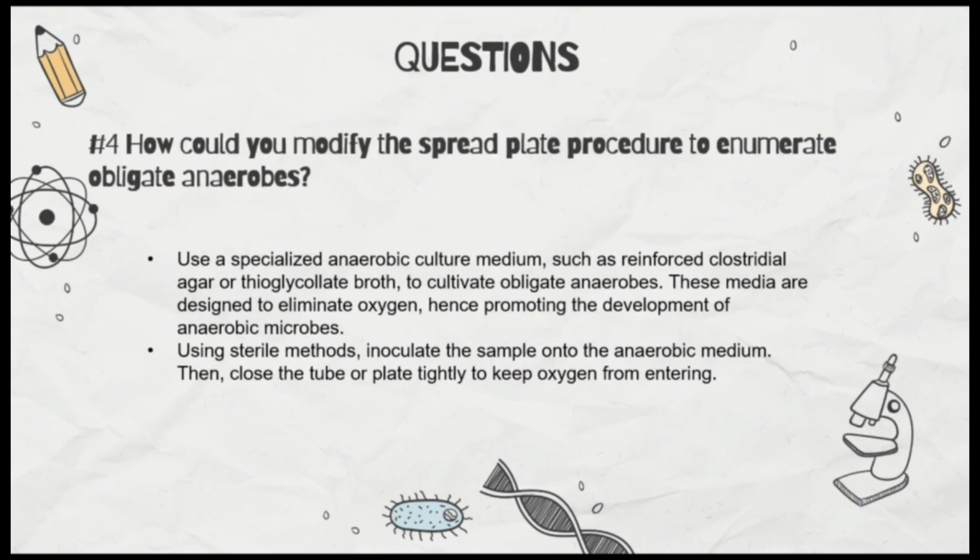For the last question, how can you modify the spread plate method procedure to enumerate obligate anaerobes? It is by using specialized anaerobe culture medium such as reinforced clostridial agar, or we can use a sterilized method.